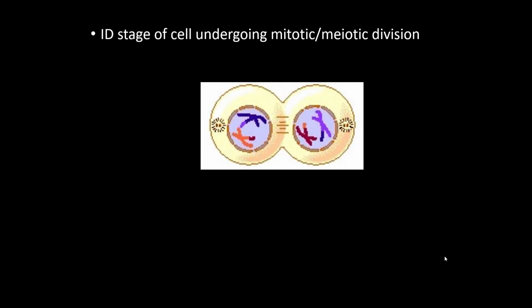All right, so we just said this was telophase, but what's different here? Well, here I still have those chromosomes that are present. This is going to be telophase 1 of meiosis 1. So telophase 1, meiosis 1.